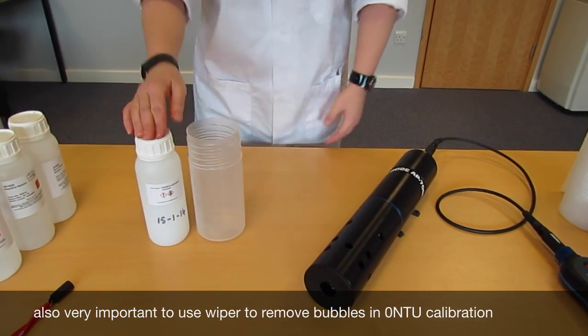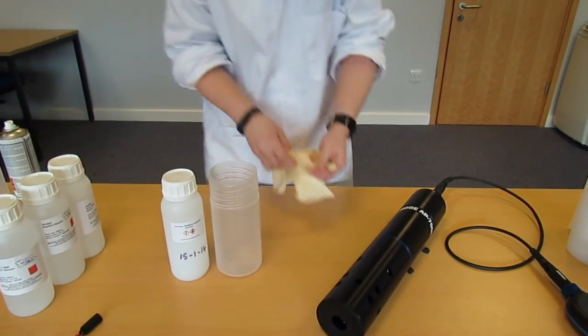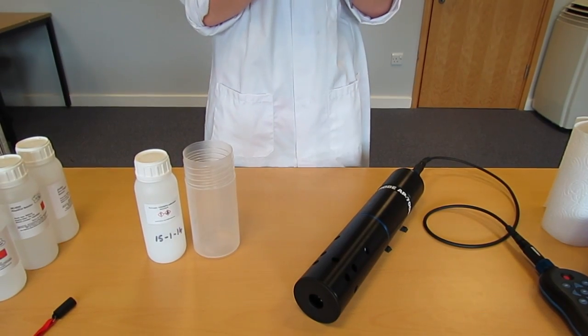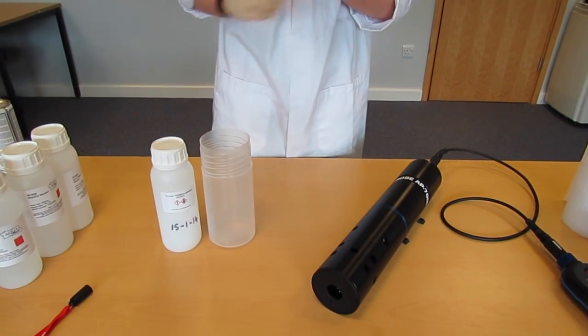When using formazine, PPE is very important, so I'm going to be wearing gloves as it's hazardous. Please refer to the manufacturer's MSDSs if unsure.